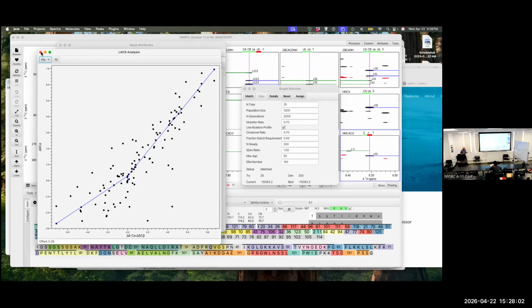What are the 2 peaks in the lower right that are placed off? Yeah, good question. Could be wrong. That's the sort of thing you look at. I don't know if this will work, but you should be able to click on them and see what they are.